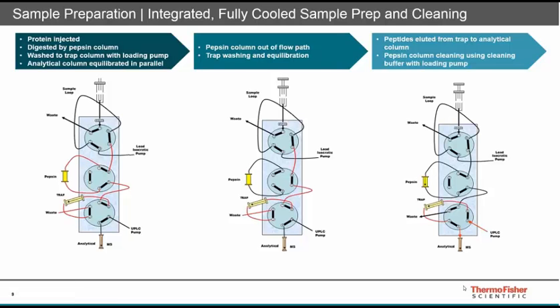This slide nicely showcases why the setup is using 3 valves and 2 pumps for fast and efficient sample preparation, for cleanup and elution with parallel column cleaning and equilibration.